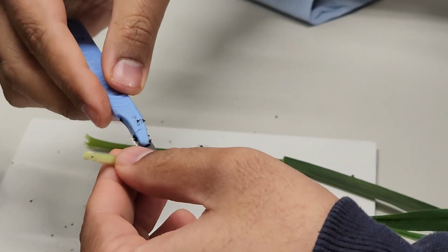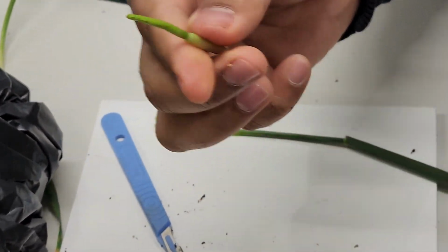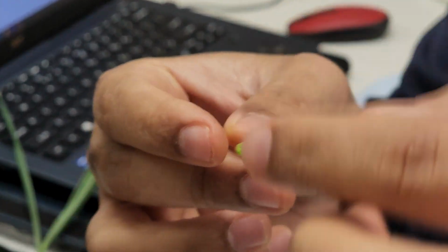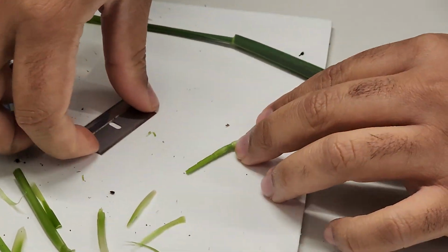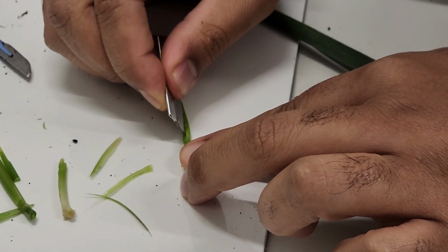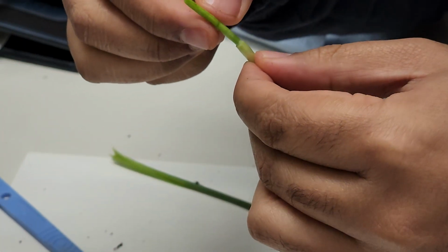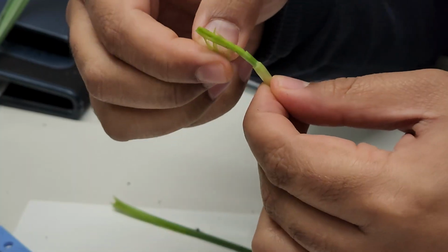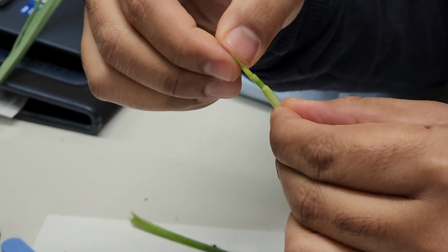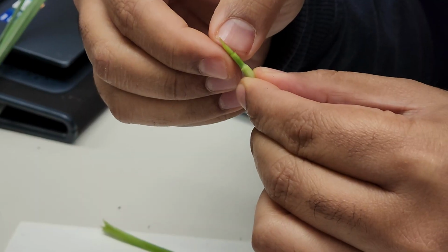So you need to use the back of your blade. There's a lot of skill involved in here. Right. So if I'm right, the meristem is actually in these concealed layers of leaf primordium. Carefully enter it. Remove it layer by layer. If you got it right, remember what you saw the other day? We should be able to get that.